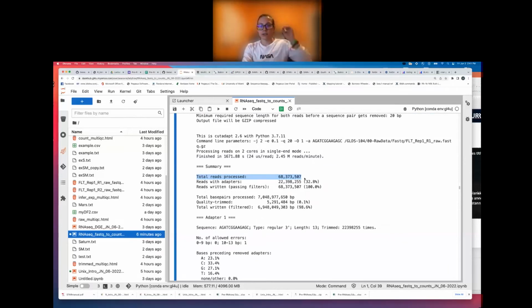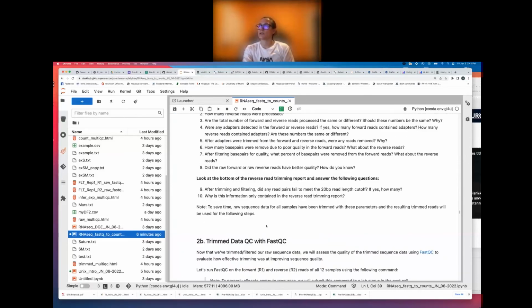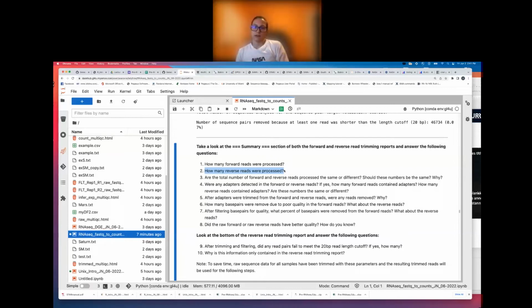Next question, Armin, this one should be quick and easy now that you guys know where to find this information. The next question is going to be how many reverse reads were processed? So now you want to take a look at that reverse read trimming report. It looks like I skipped that question and went to the next one. Okay, that's fine. You guys want to put it in the chat? How many reverse reads were processed? So we don't have that question set up.